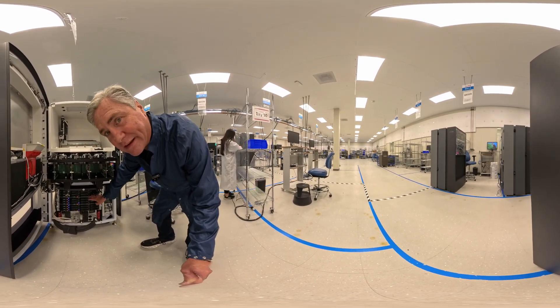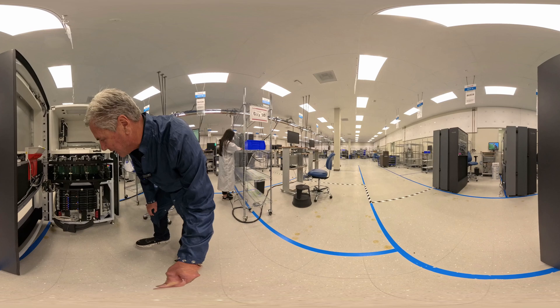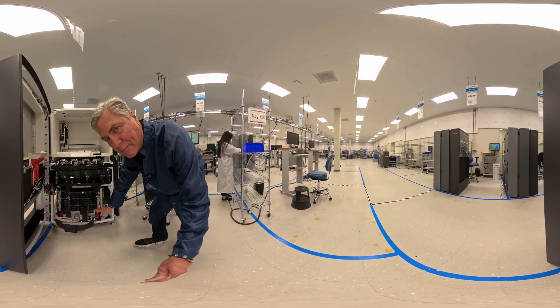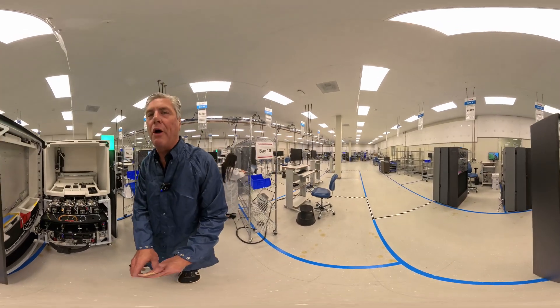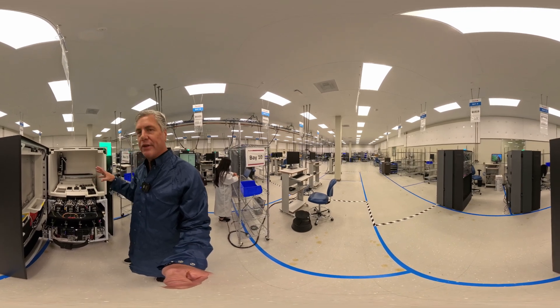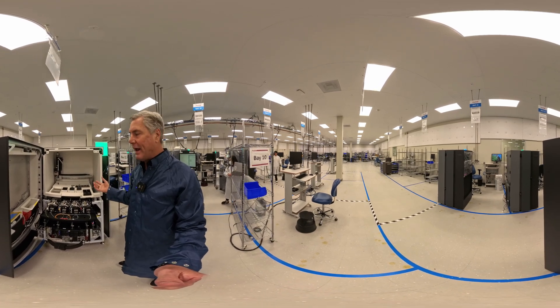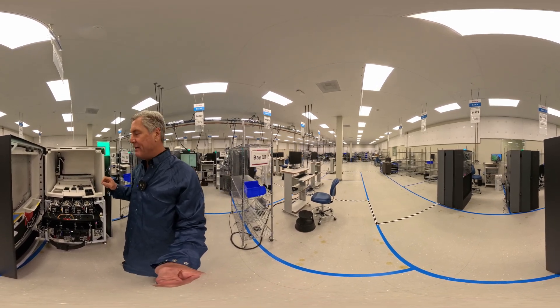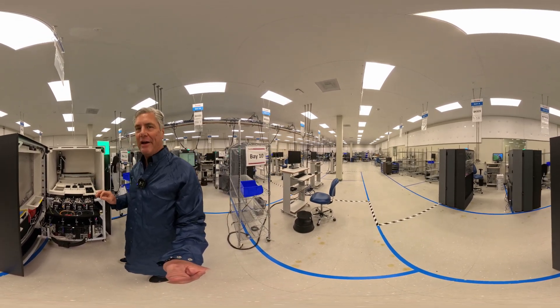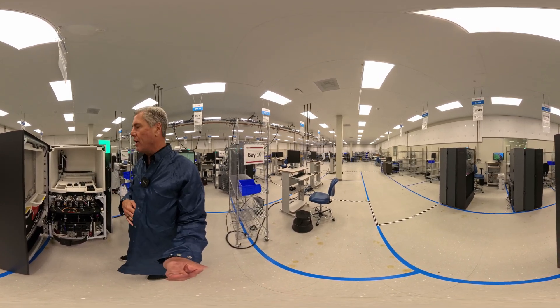As you look down below you can start to see the incredible compute that's required for each Revio run. We use six Nvidia GPUs — some of the top-of-the-line GPUs — and at the bottom of the instrument you see all the cooling and temperature regulation. All in all, we've been able to shrink our instrument down into this form factor for Revio that we can ship anywhere in the world. It's fully self-contained — all the compute you need is right on the instrument — so you go straight from your sample to HiFi data, which you can then analyze using our targeted workflows.